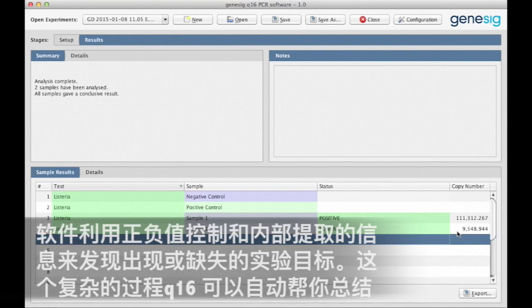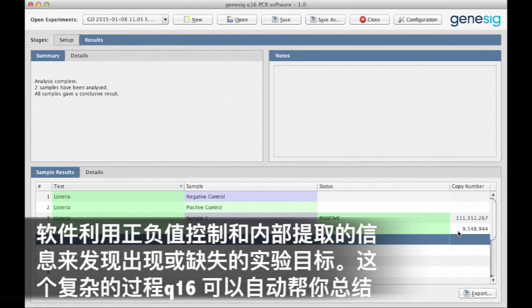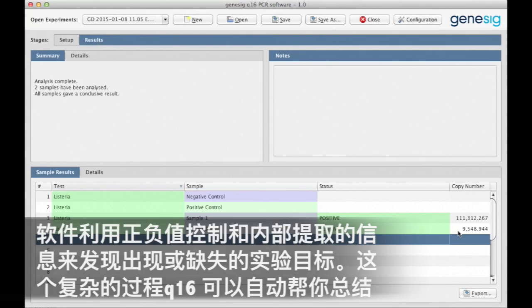The software uses information from the positive control, the negative controls and the internal extraction control, as well as detecting the presence or absence of the target. This complicated analysis is completely automated for you on the Q16.